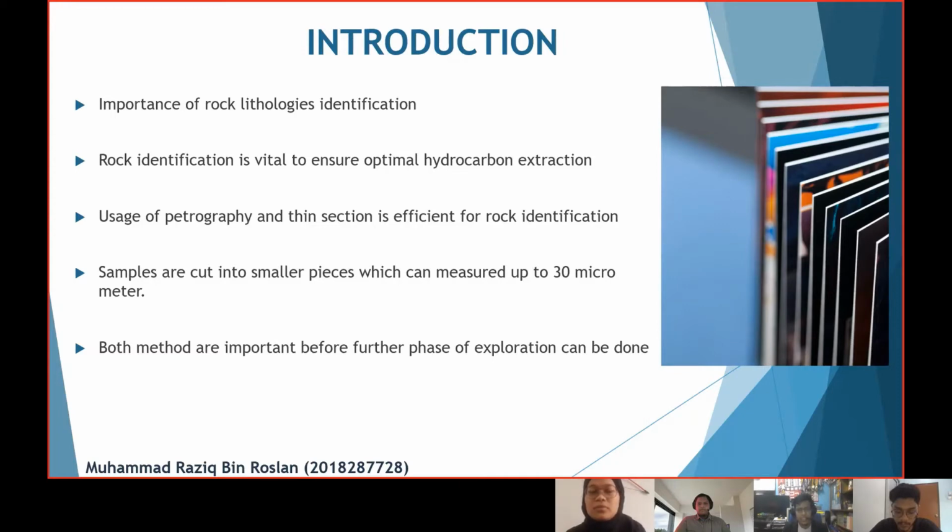Modern science managed to create an efficient way to determine mineralogical composition and structure through the combination of both methods. I will explain what petrography is. Petrography mainly focuses on analysis that involves transmitted light under a polarizing scope, while thin section is used in determining the rock origin and evolution of the parent rock. The thin section always includes the placement of the sample under polarized transmitted light. The thin section is responsible for highlighting composition.